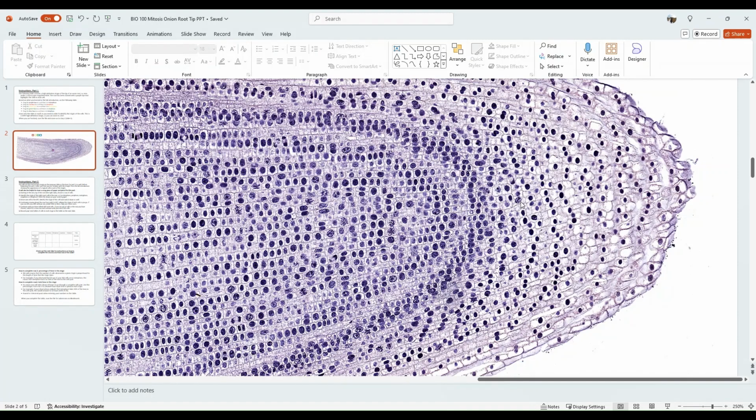We keep going and we see the next one looks more like prophase, right? It's not a solid dark blob anymore. The chromosomes are starting to take shape. So now I put a tally under prophase. And now we keep going. Interphase, interphase, interphase, interphase, interphase. If you get to a cell that you can't really tell what it is, you can just skip it because it doesn't really matter which 100 cells you pick. We're just trying to pick 100.